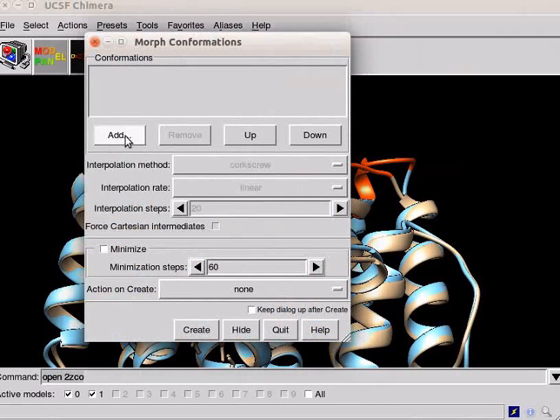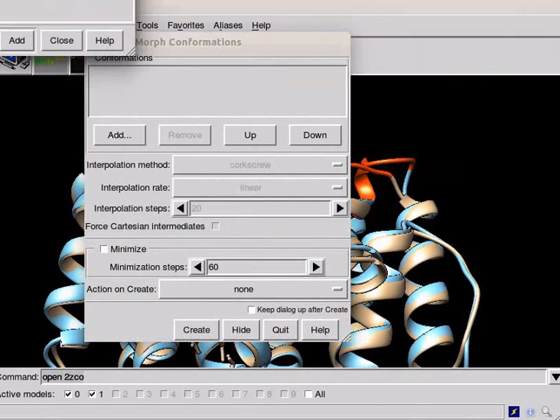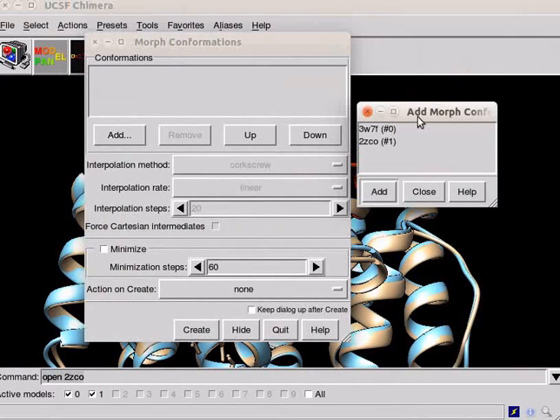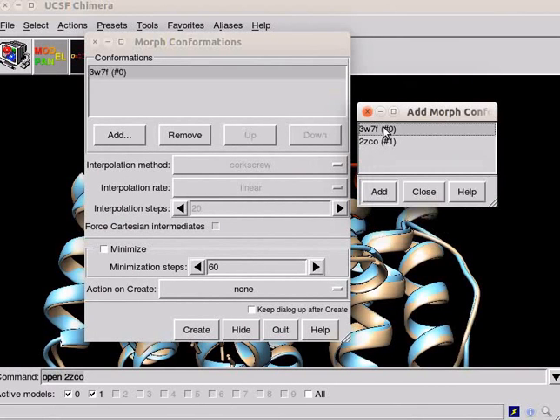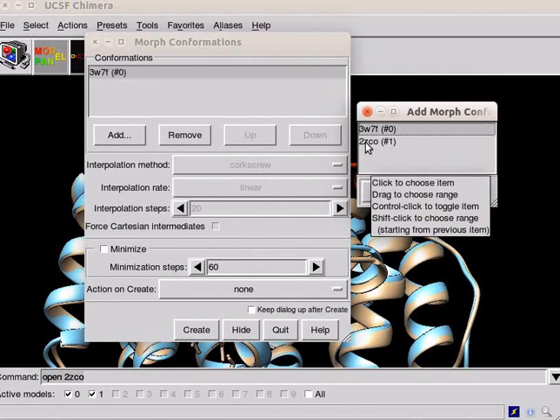Click on add. In the resulting list of the models dialog box, double click on model number 0 that is 3W7F to add to the conformations.